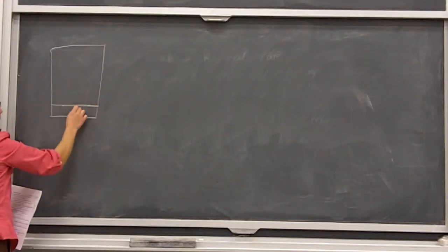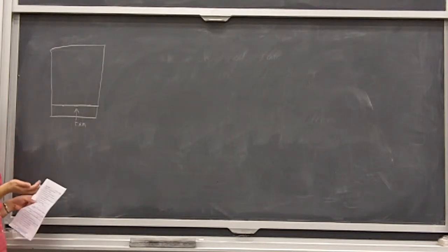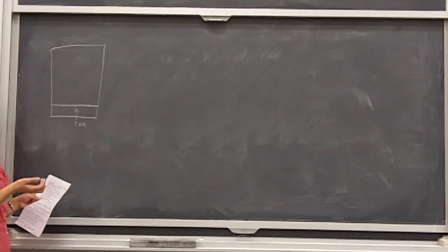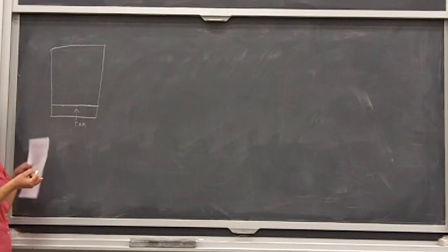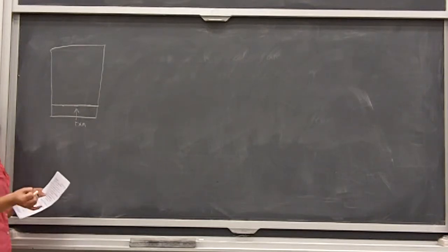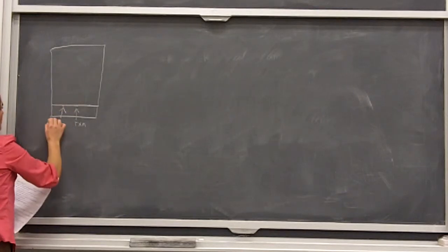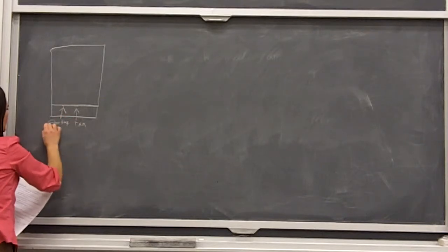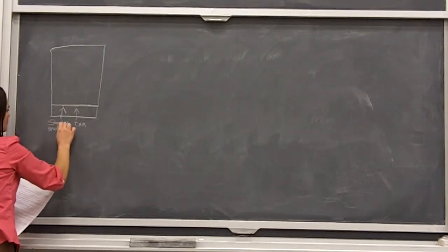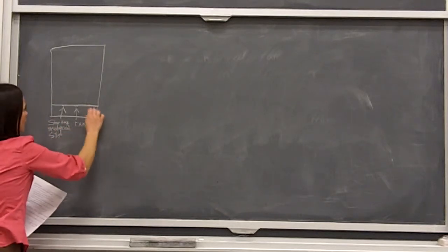The middle spot is our reaction. Then we have standards for our reaction, which you do for experiment 12. You have your dienophile as a standard, and you have your experiment 12 product as a standard. So you have a standard for one of your starting materials, and you have a standard for your product. So you've got starting material standard, product standard.